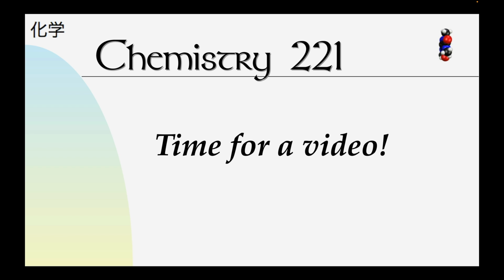Okay, at this point, I think it's time for a video. I'm going to try and show you a little bit as to what it will be like in the lab. This won't be the best video because the equipment we use will be different, but you'll at least get an idea of what to expect and how to see it.